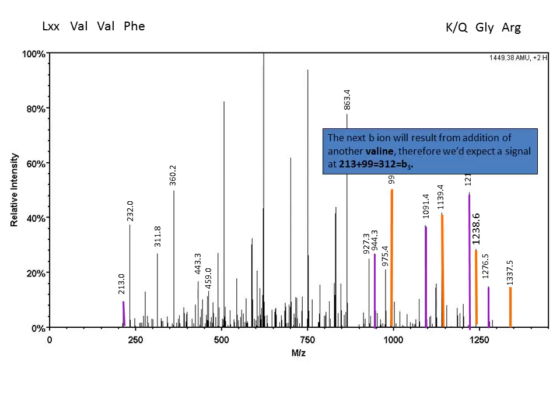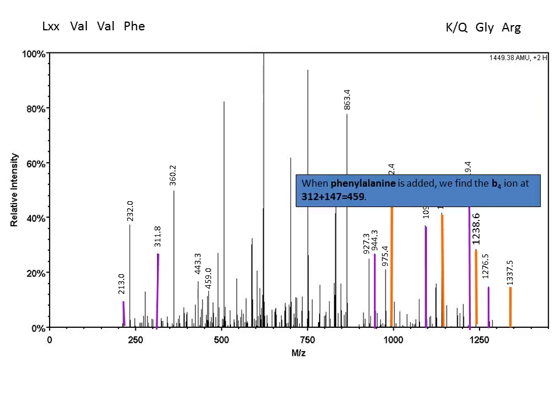If we then look at what we need for another valine, leucine, valine, valine, we need a mass of 312, which is also present in our spectra. Therefore, we can start walking up our mass range looking for ions that complement the C.